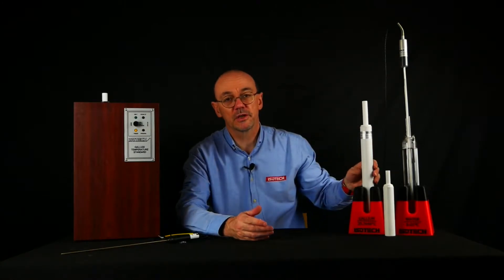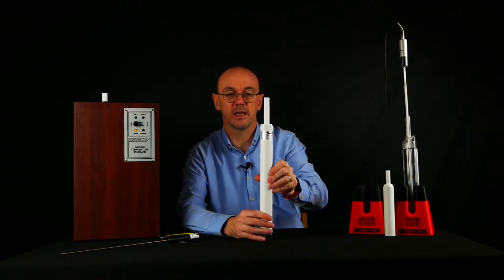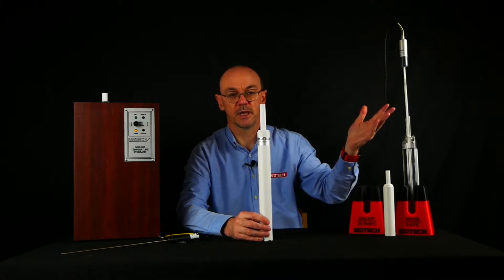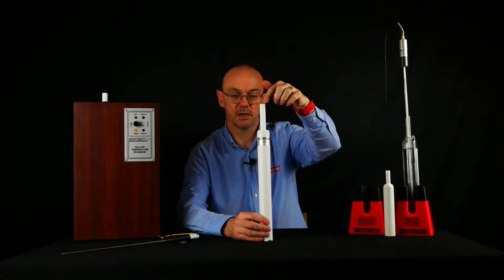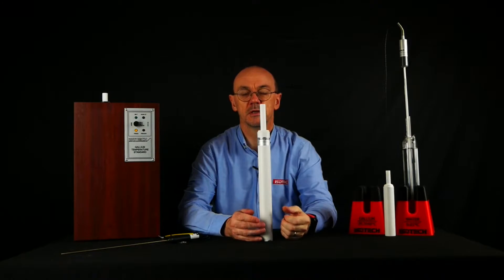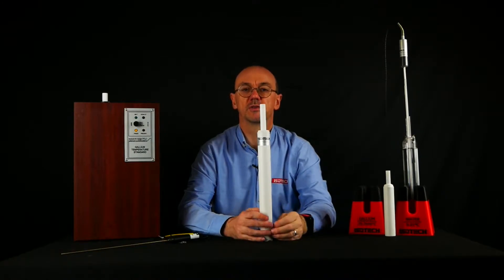So I have a practical gallium fixed point cell here. The SPRT or the thermometer being calibrated comes into the tube here. If the cell is sealed, the thermometer doesn't make direct contact with the metal.